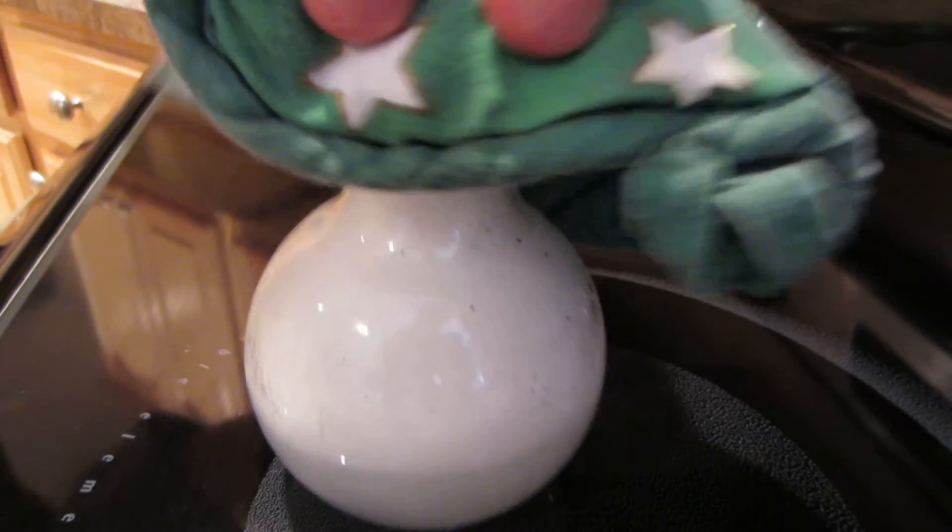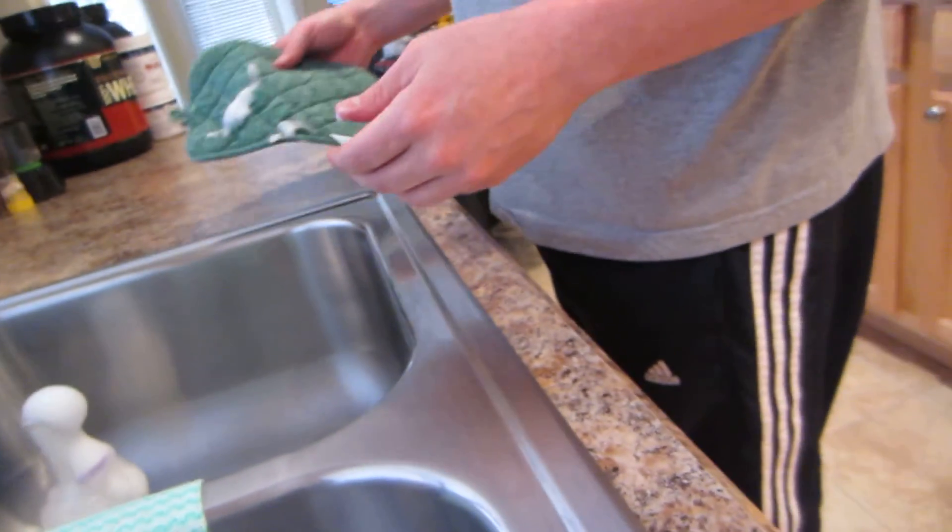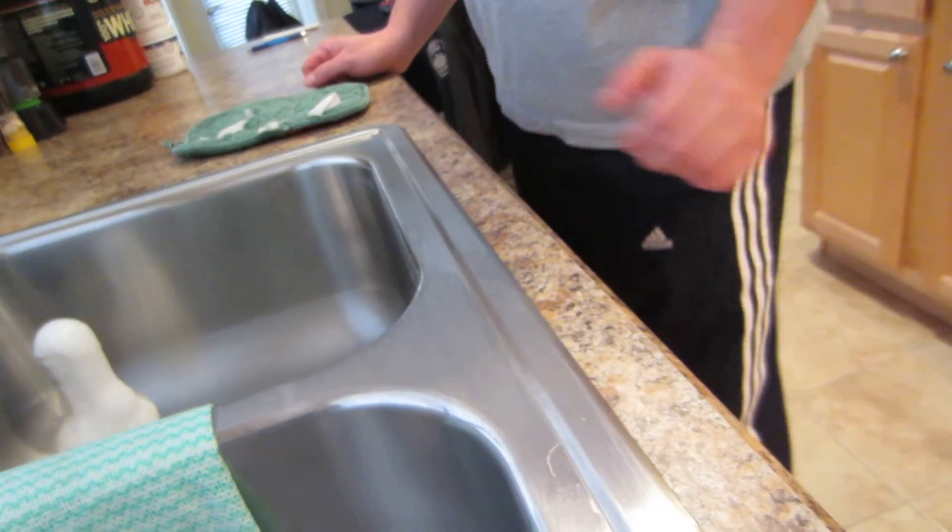Just gonna go open it up. There goes the litmus paper. Oh, that phone is probably hot now.